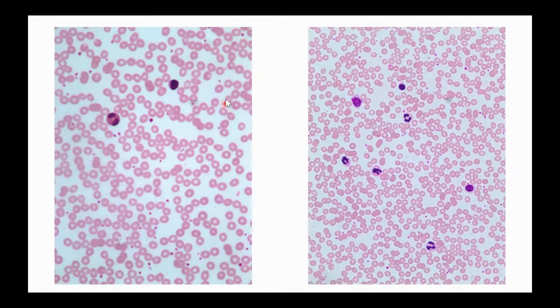These little tiny dots that we're seeing here, do we happen to know what those little tiny dots are? What are those things called? Those little purple ones. Well, the erythrocytes are the big red ones. This is probably an eosinophil, a type of white blood cell. These little tiny guys here, and you probably don't have to know them until AMP2, but I'll mention them, are platelets.